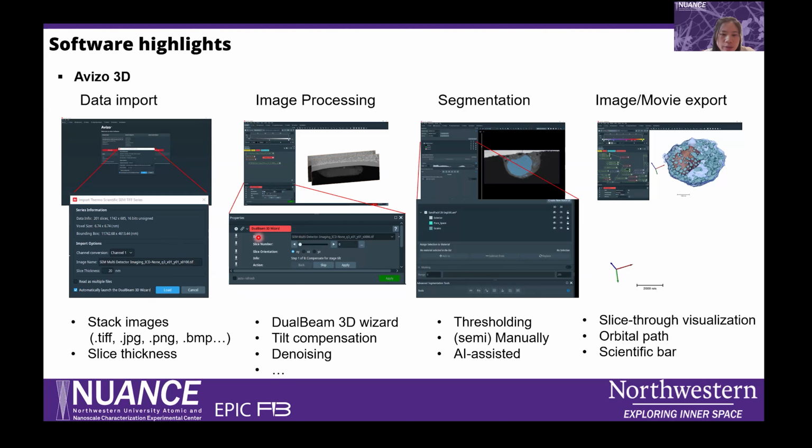After that, the dual beam 3D wizard will help you do the tilt compensation, denoising, cropping, and anything that you have to do before further image processing.